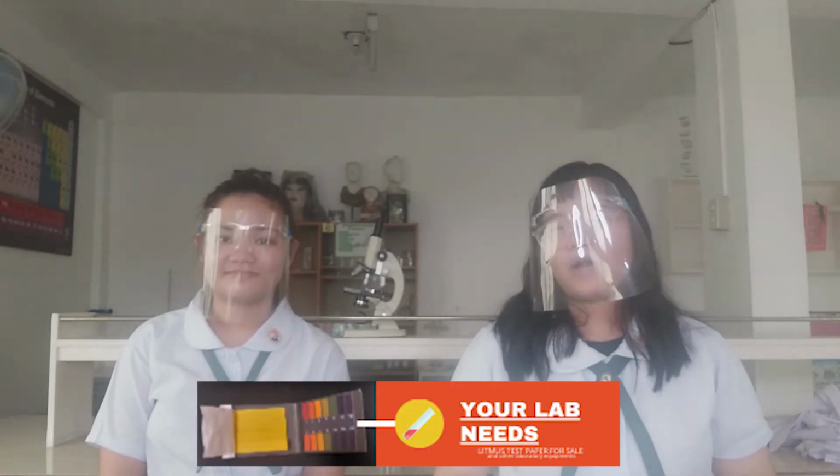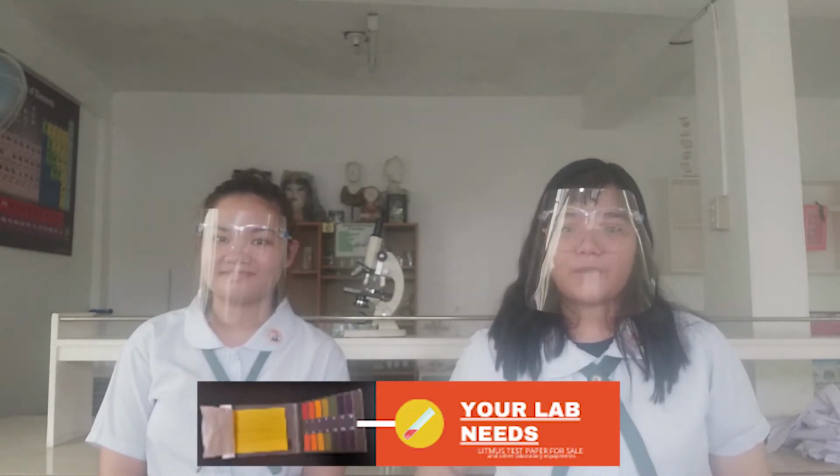So let us talk about the different tools and equipment that are used in this subject. Of course, before we proceed to various experiments and even topics about different principles and theories in chemistry, let us first be familiar with different kinds of tools and glasswares that we are going to be utilizing in chemistry.